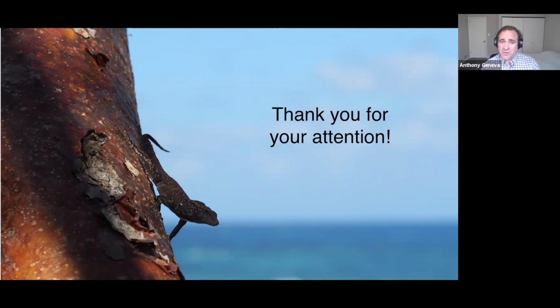Our first pass, which I didn't talk about here, was with the sagrei from North America, and it just blew up on us. It had far too high heterozygosity to be assembled, even at that early Illumina stage, effectively. And rather than try to run down a fix for that, we opted to use an animal from a population that we knew from previous evidence was highly inbred, with extremely low heterozygosity. So I'm sorry to the person who asked the question, I don't have a really good answer yet for what we're going to do with our resequence data, and I don't have a great solution for dealing with heterozygosity except avoiding it for de novo assembly.